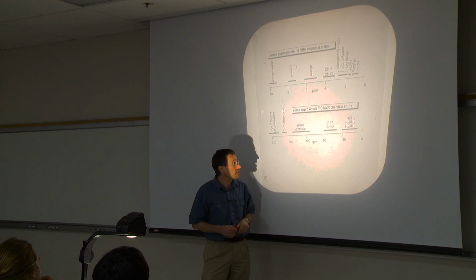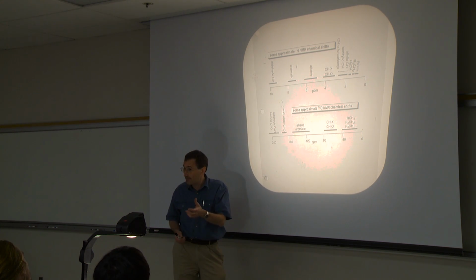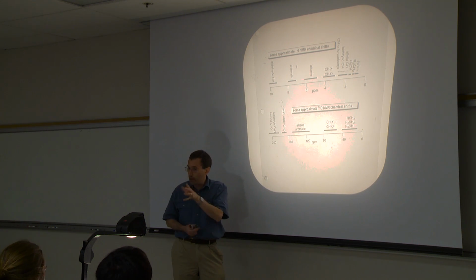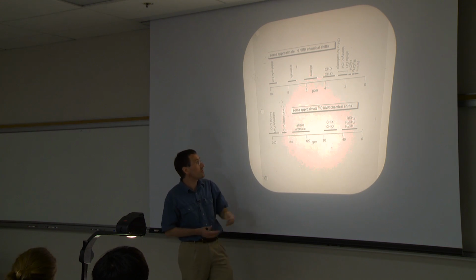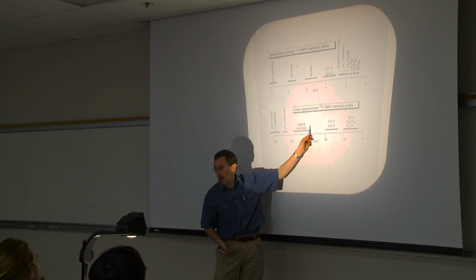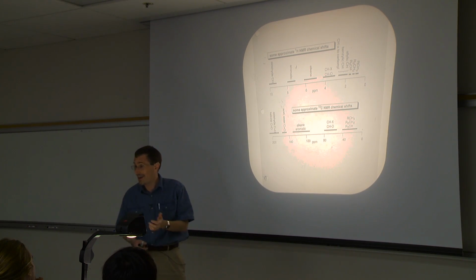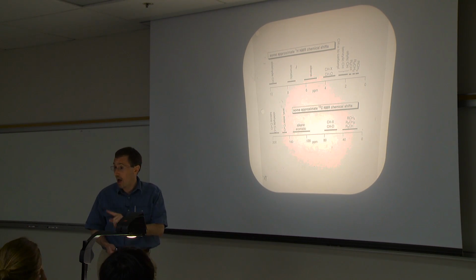Now, I'll tell you in some problems that I give in a more advanced class, people sometimes get surprised. Like a carbon with 2 oxygens attached is usually about 100, 103 parts per million. So people might look and say, oh, I think it's an alkene or an aromatic, and yet they'll see, wait, there's only 1. And eventually they'll figure out, no, it's a carbon with a lot of electron withdrawing groups.